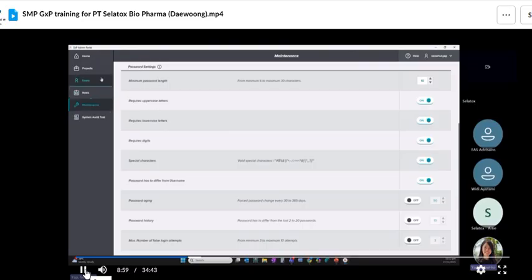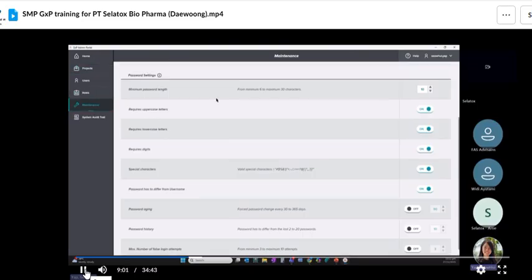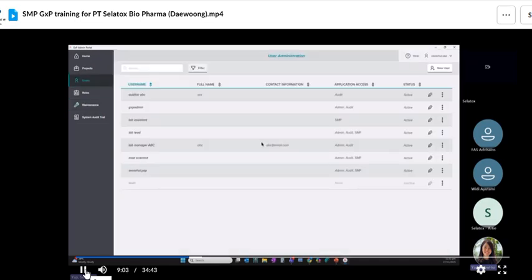One thing I want to let you know: if you set a user to have admin access, it will not use the user licenses. I showed you just now, I have a total of 5 users, and then 4 used up. It is based on SoftMax Pro access.